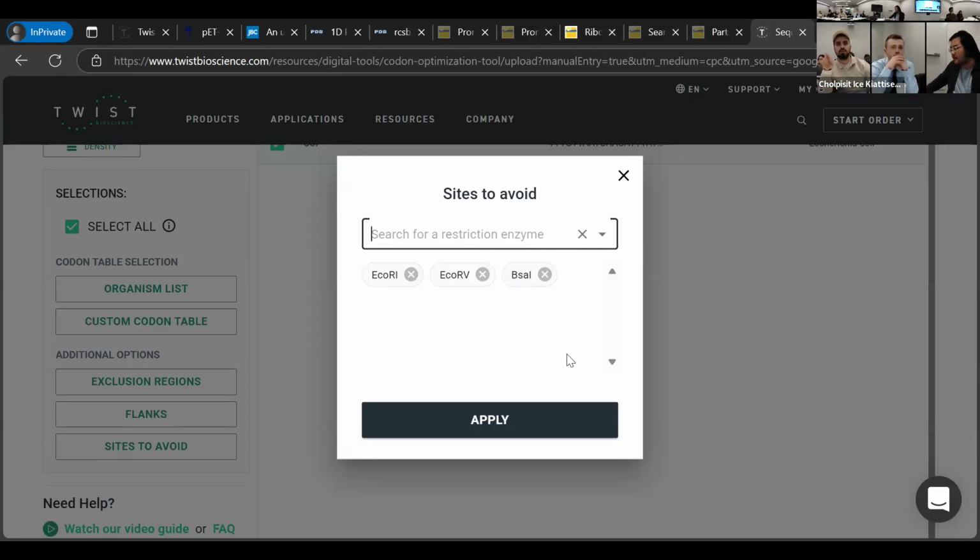And you're doing E. coli for this one because your cell-free lysate comes from E. coli? Exactly. Good question. Yes. If you're doing human cell-free lysates, you may have to optimize for humans, and you have to use the human promoter, the human terminator, and the human ribosomal sites.